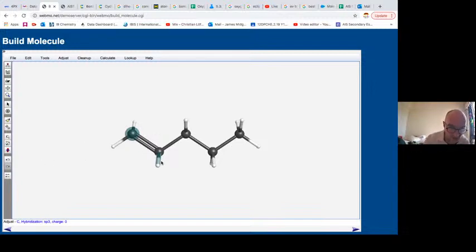Anyway, that's fine. If we give it 2 clicks, it gives me the bond length. What do I mean by 2 clicks? Let's do that again. So I've got my pointer tool. I'm hitting my terminal carbon atom, still an sp3. I'm hitting my second carbon atom. It's telling me the bond length is 1.54 angstroms. Angstroms, international unit. You don't need to worry about it. It's a numerical value. Learn it, deal with it, move on with your lives.